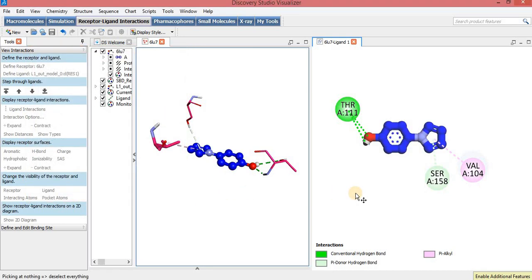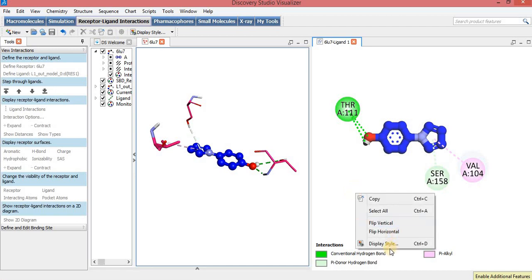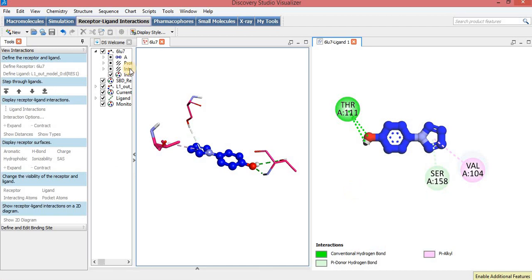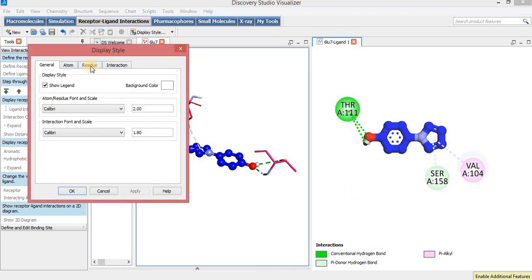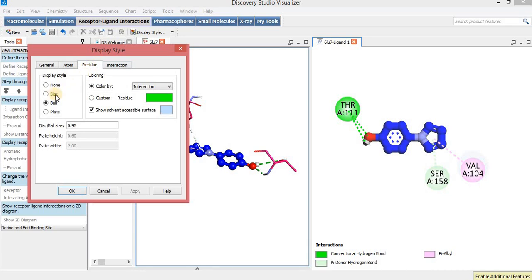To change the display style of the amino acid residue, just right-click, then Display Style, then Residues, and I will select the Disk display style, then Apply and OK.